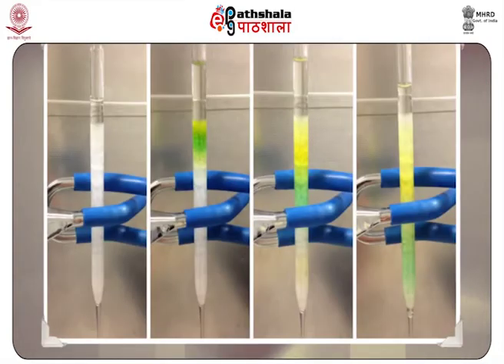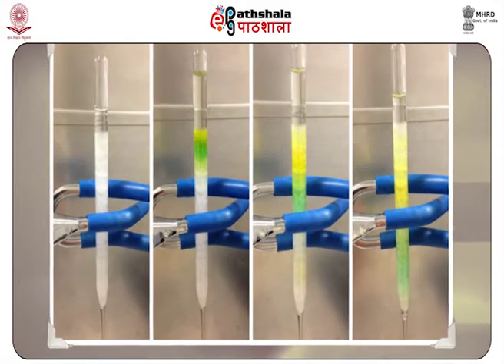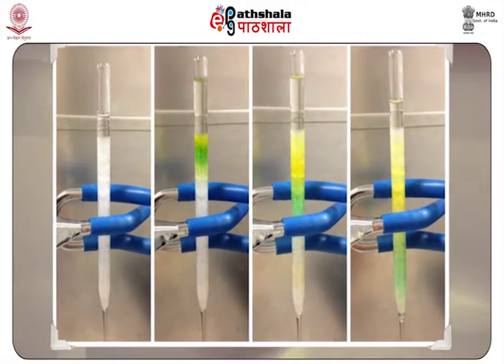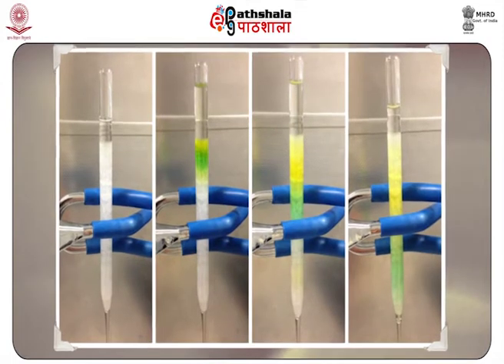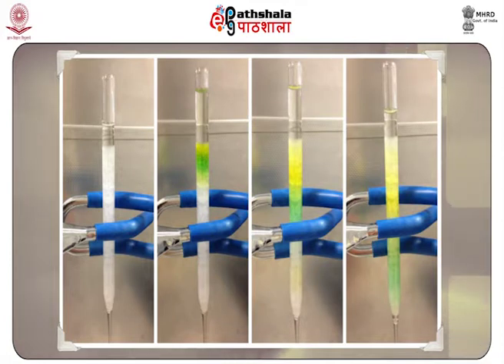All sample components show differential affinity towards their stationary phase and thus elute out of the column at different times along with the moving mobile phase.